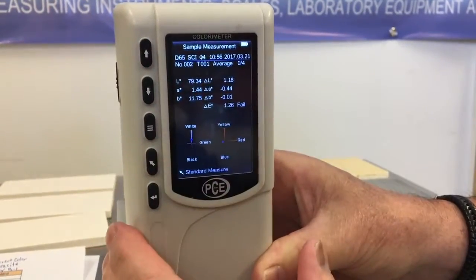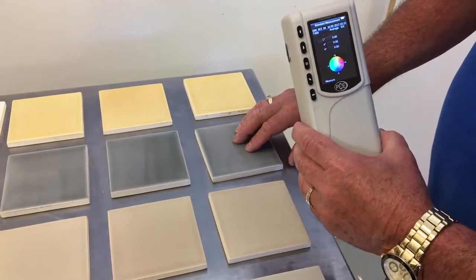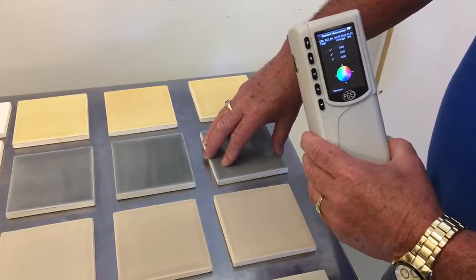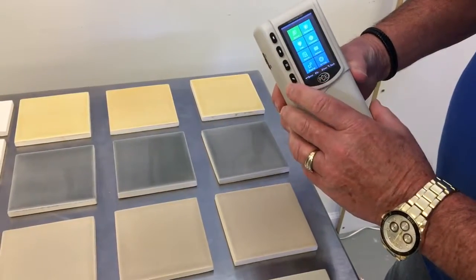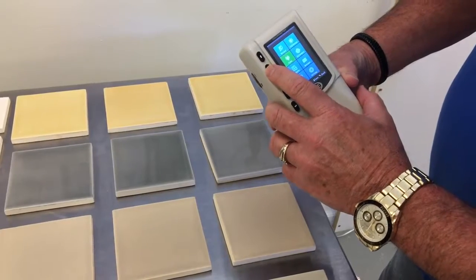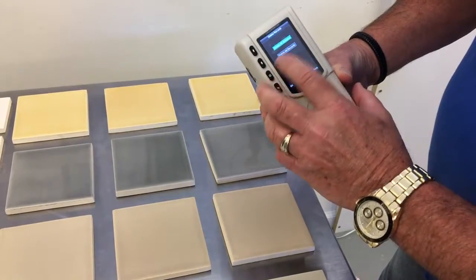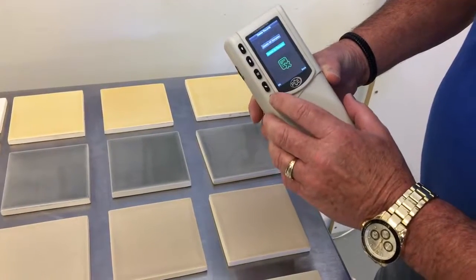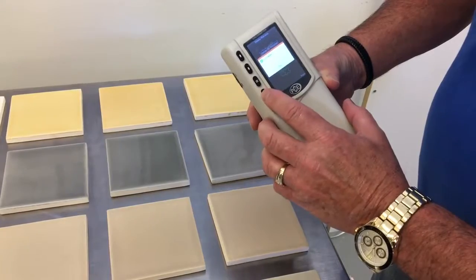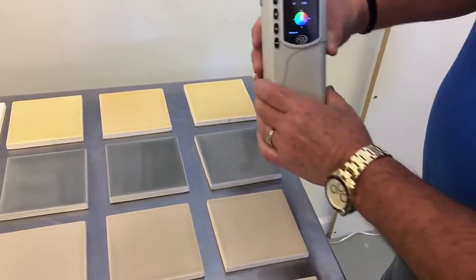There's our standard on the left. Okay, we're finished with this standard. Now we're going to move up to this gray standard, which means that we have to delete all records and re-establish our starting point with this color. So we go into menu, go down to delete, Enter, delete all records, go down, Enter, delete everything — yes. Now we're ready to set our new standard and record our standard.